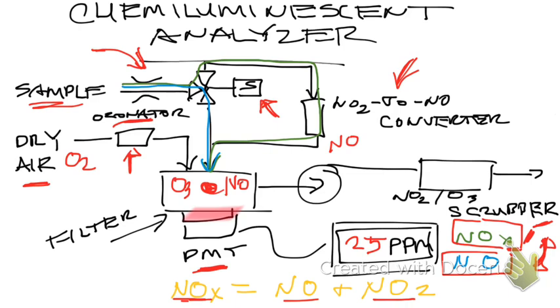And the purpose of it is that it can be used for both monitoring the ambient air and also for monitoring the concentration of these pollutants in a stack. So this technology can be used in both places. But in a stack, I would expect the chances of things plugging off to go a little bit higher, so you want to be using good filters so your capillary tubes won't plug off in this analyzer. So it works well definitely in ambient air monitoring. The analyzer that we have in the lab can go down to the part per billion range, so it's quite sensitive.